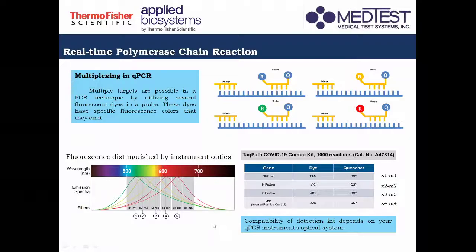instrument. Say for example for Quant Studio 5, which is your qPCR instrument, it can detect at least 6 types of reporter dye. So that means you will be able to multiplex, not at least, a maximum of 6 targets in your PCR reaction.